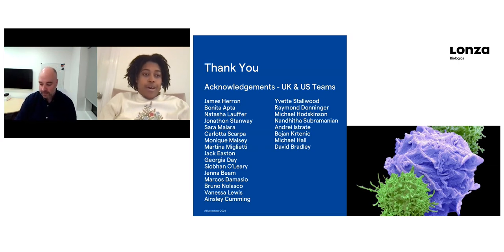Great. Okay, next question: do you do peptide cleanup after acid elution in MAPS? Yes, so this is done at ImmuneSpec, so they handle that part, but there would be some cleanup of the peptides. I'm not sure exactly how they do it off the top of my head, but once they elute, there will be some cleanup before it goes on to the mass spec.